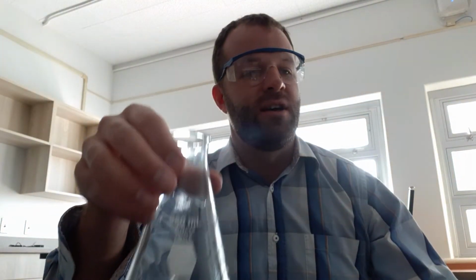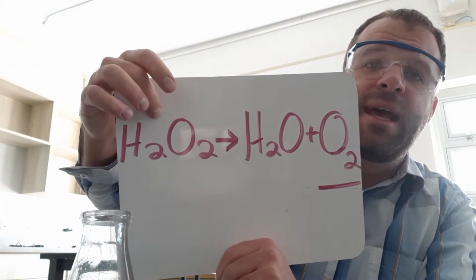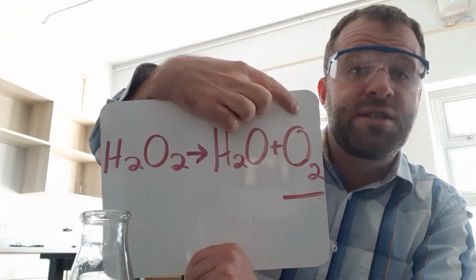Our second demonstration, we're going to try and test the presence of oxygen. Okay, we'll be looking at this decomposition reaction where we have H2O2 as our reactant, and we're going to see this molecule break apart into H2O. We're going to try and test the presence of oxygen now.